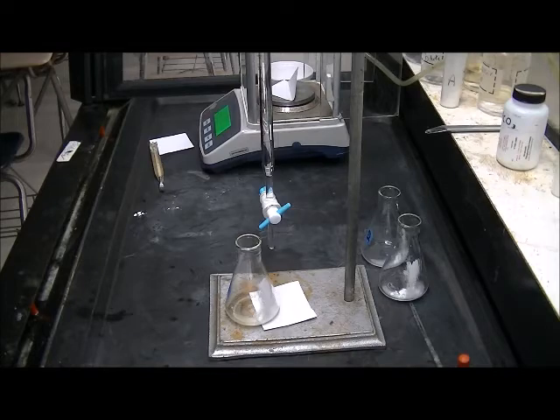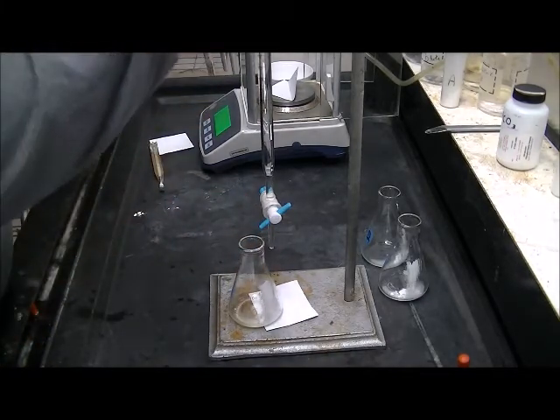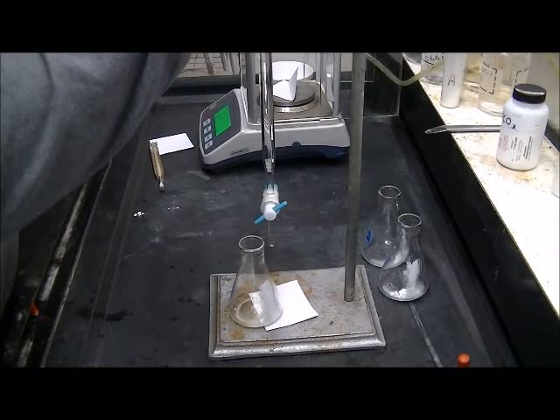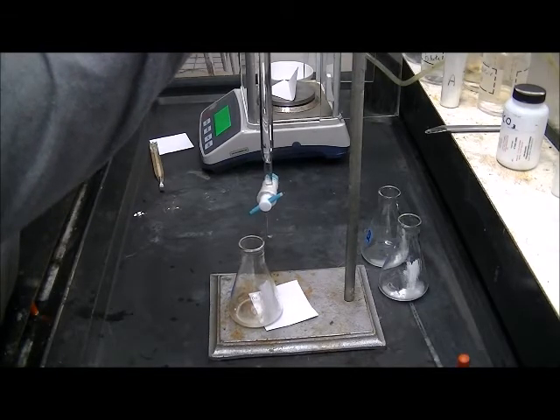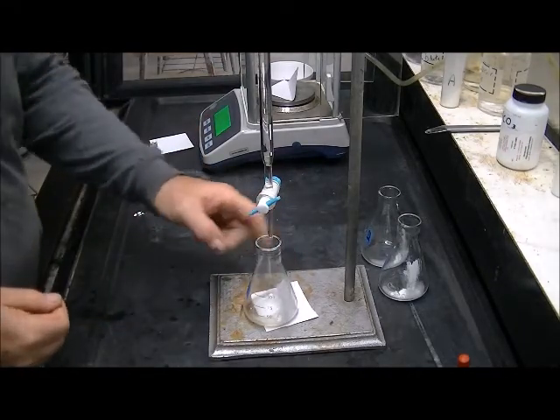One thing I want to point out when I'm doing this titrating is I don't want that tip down where it will hit the flask. So I'll just move the burette up a little bit so that when you're swirling you don't hit the end of the burette and possibly break it.